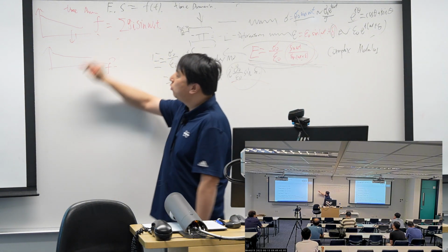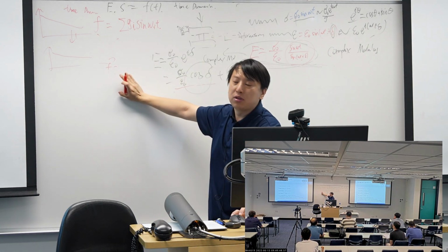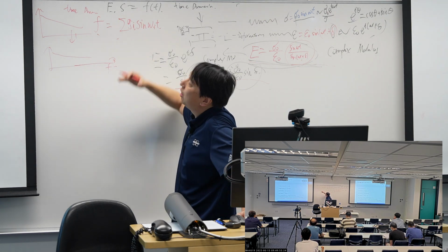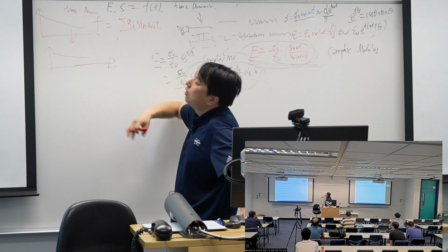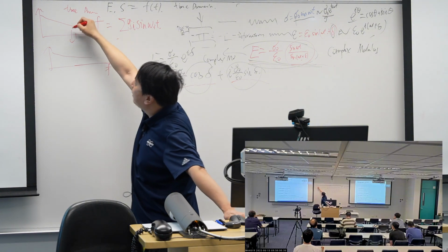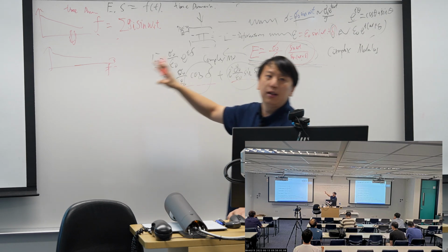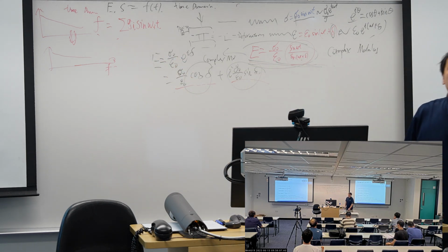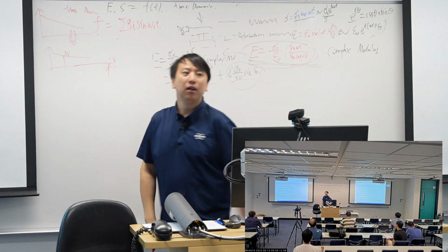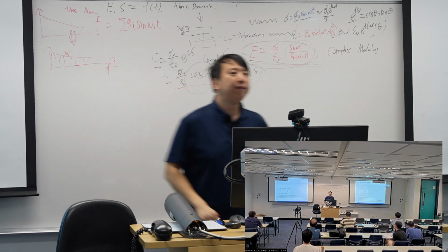So for time, we need to change to a continuous spectrum on the frequency domain. So actually, the time stuff we also need to show in a lot of frequencies in the frequency domain. So basically, we should not just do one frequency, but we need to do a series of frequencies.